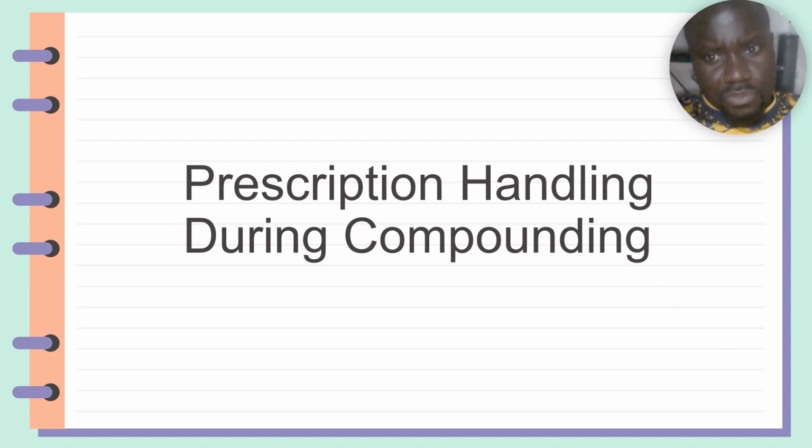I'm sure by now you've come across principles guiding how you handle a prescription, and most of the things that have been given to guide you are similar here, except here you are producing a product. So there are a number of principles that need to be reminded of you so that you pay attention and assure safety of the patient and legal compliance to the requirements of compounding.